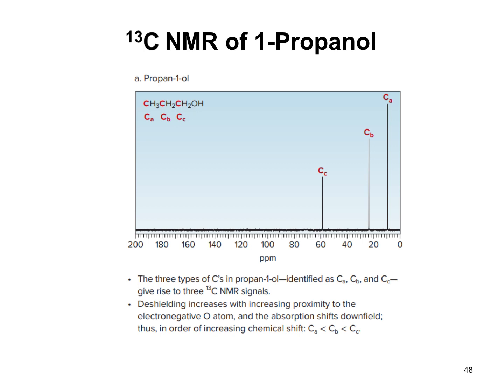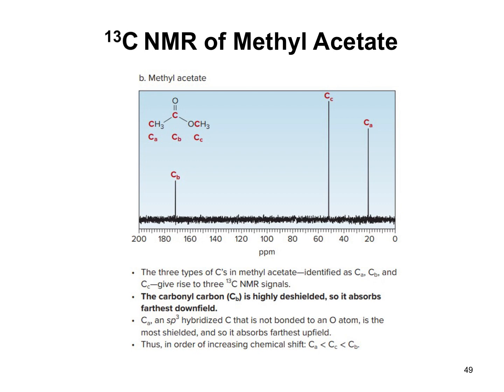That's going to be this carbon C. Then you would expect carbon B to be next, and then carbon A as well. So this tells us the 3 types of carbons that we have, and it also indicates that this carbon is attached to an oxygen.